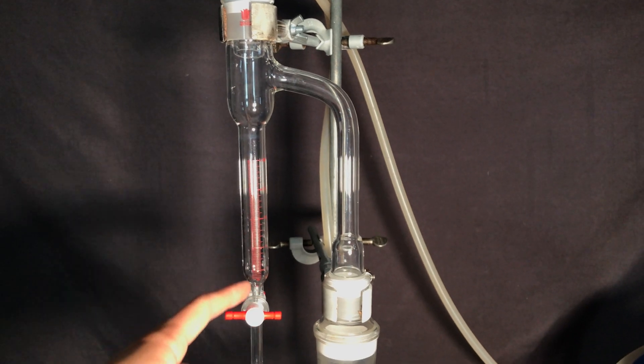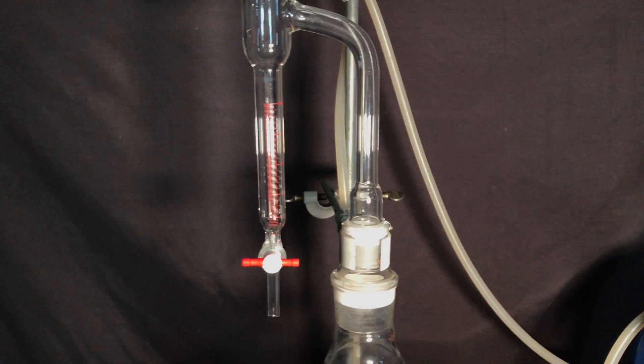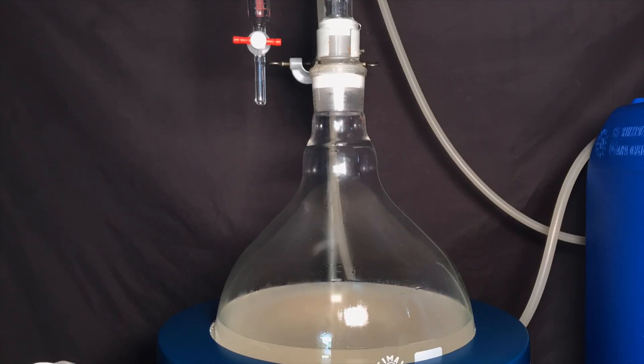A Dean-Stark trap is a simple piece of equipment. Water and solvent come over and the water doesn't dissolve very well in the benzene and continues to settle on the bottom. It can then be drained off.